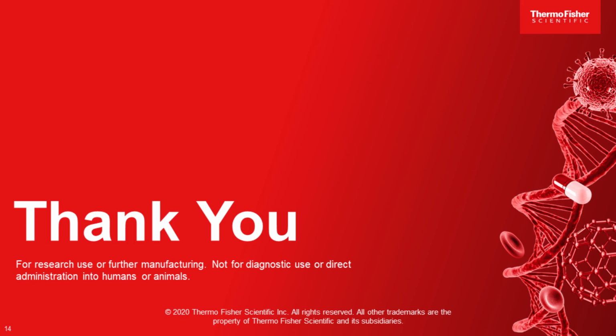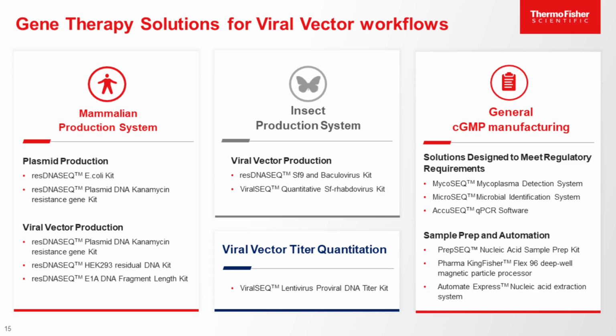We don't have the new Thermo instrument. The digital PCR instruments right now are validated, obviously, on the Absolute Q. We do know from customers that have been using some of our assays also on other platforms successfully. Some assays did not work, right? Especially if they have a highly abundant target, it creates challenges with the technology, and that's what obviously makes it difficult to have an excellent assay right now for digital PCR, but that's why we have those on our roadmap also to support our customers with an excellent solution there.